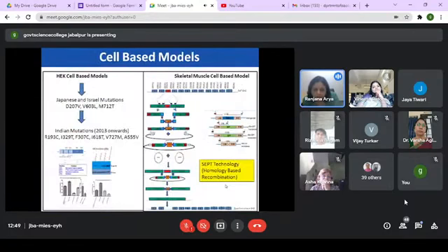So these were some of the success stories that we have, because when we started the lab, we made this HEK cell-based model with the pathologically relevant mutations of GNE being expressed. Earlier at that time, we knew only Japanese and Israeli mutations. Now we have Indian mutations known, and we have a system where we have cells expressing these recombinant mutant proteins. We can try to address various cellular phenomena.